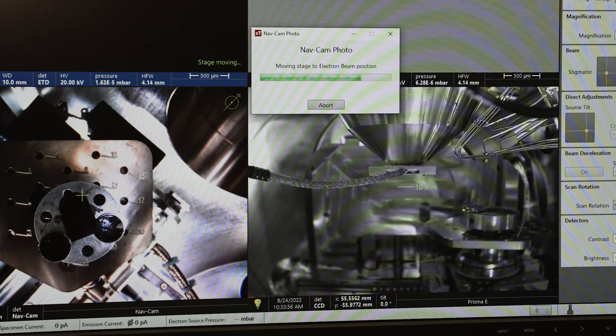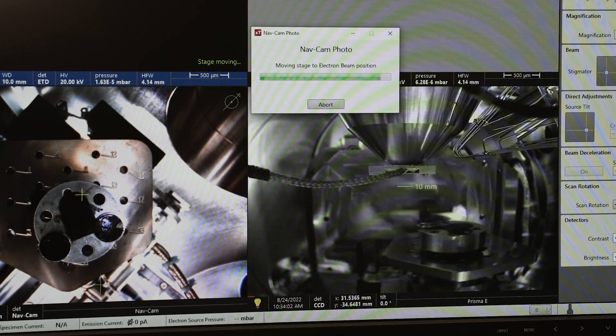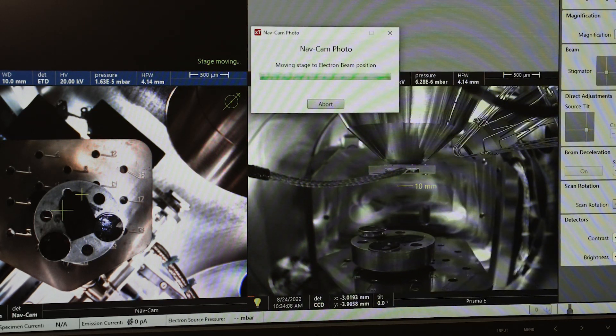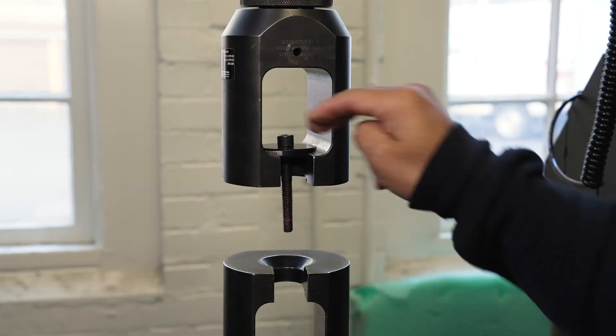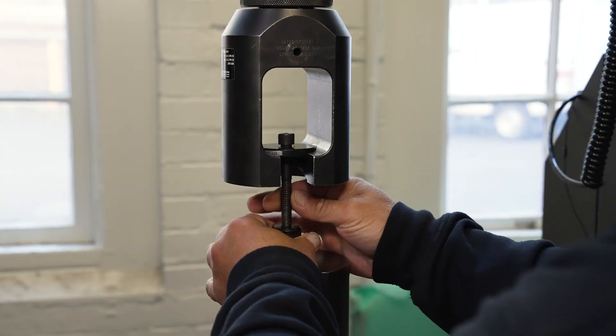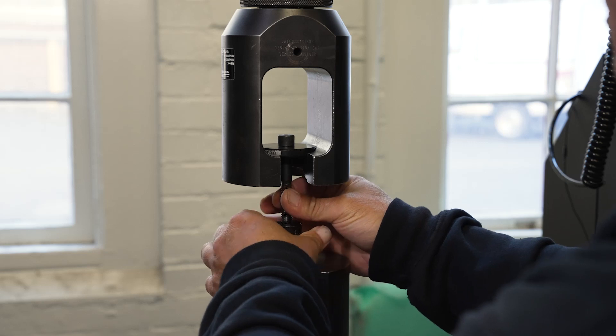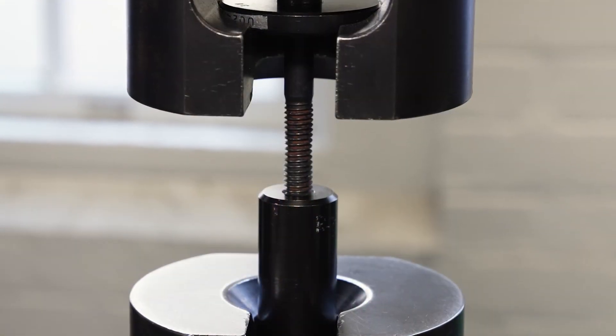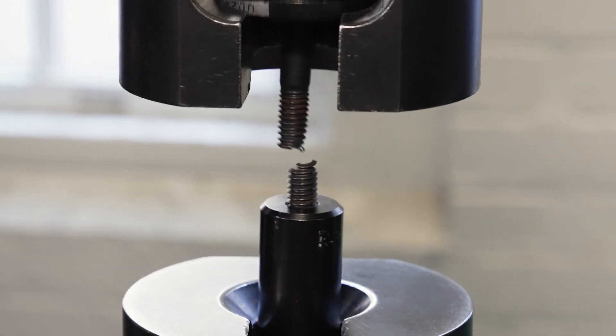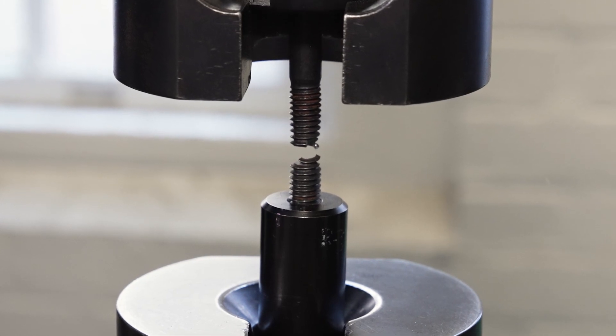A scanning electron microscope is used to study fracture surfaces and identify foreign material particles. Code 134.6 also performs hardness, tensile and other testing to provide objective quality evidence the materials used within the shipyard meet proper specifications.